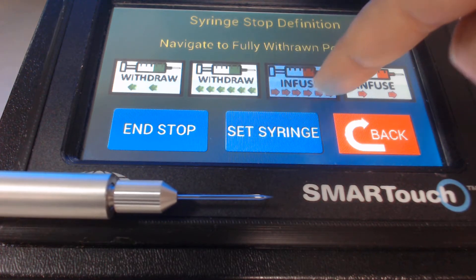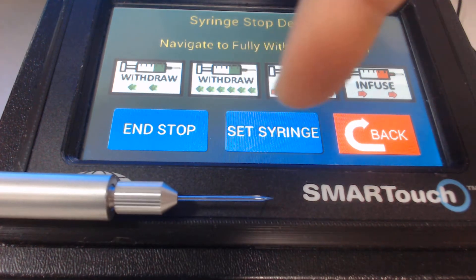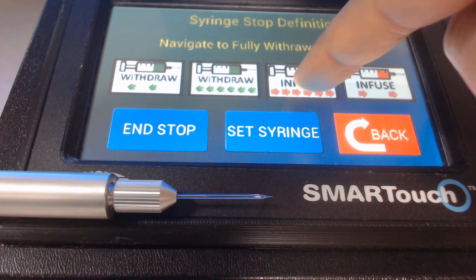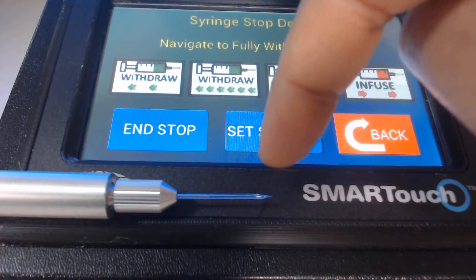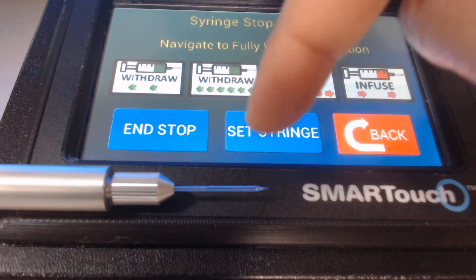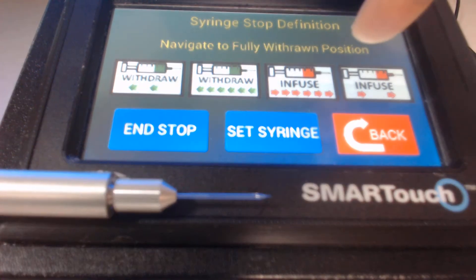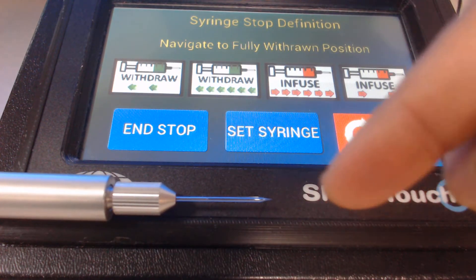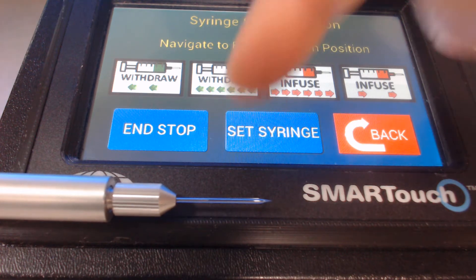For demonstration purposes, I have not put any oil inside the glass micropipette, but normally you will have oil inside. When you press the infuse button, you will see the oil coming out of the tip when the plunger is about halfway down. Get rid of the excess oil by lightly touching it with a kimwipe.